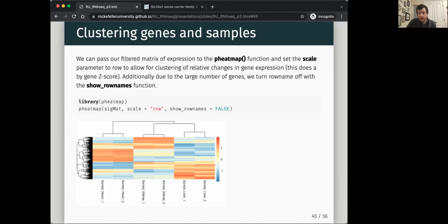But yeah, so they're touching on the clustering. You can see here that we have trees both in the y-axis and the x-axis. The x-axis is very similar to what we've seen before. The samples are grouping together. And then the y-axis, we have all of those trees here. And by default, it does hierarchical clustering to group these genes together into patterns, okay?